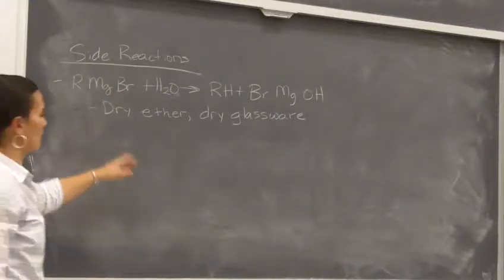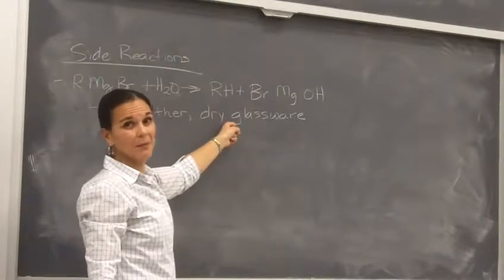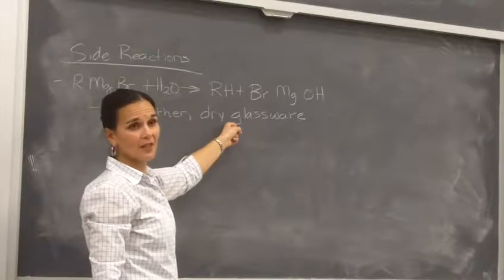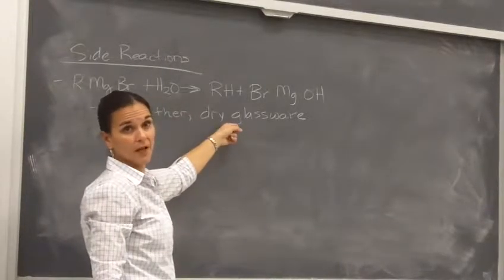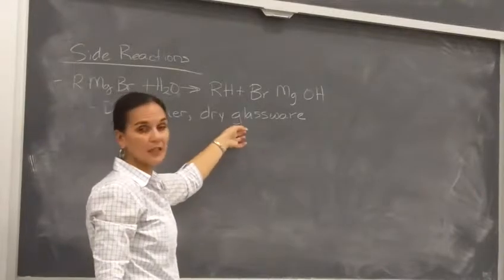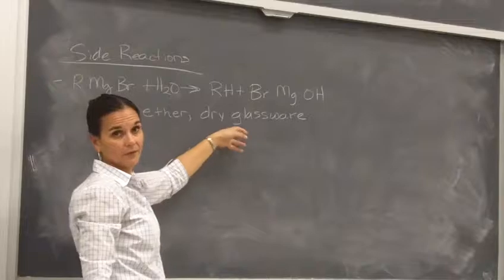our glassware, okay? The other thing with that is all the cleaning of glassware happened last week, so if you feel like you have glassware that you need to clean this week before you put it in the oven, you're not, okay? So there's not going to be any cleaning of the glassware when you come to lab. It's just going straight into the oven, okay?